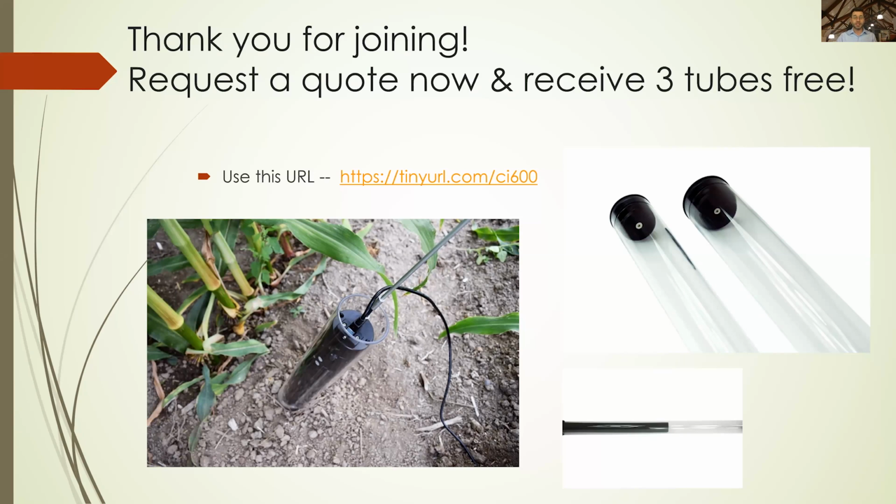Is it practical in pots for alfalfa roots? Very much like the small beds I was showing earlier. We actually have had tested and had other researchers use it in pots. It just depends on how you put it in that acrylic tube. So if you have the tube go straight through the pot, have the pot here and have the alfalfa grow around it, that's one method. You can do it diagonally. Honestly, every time I think that we've run out of ways to do it, I see somebody else come up with a new method.